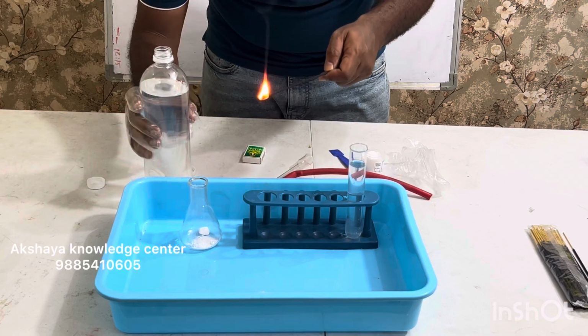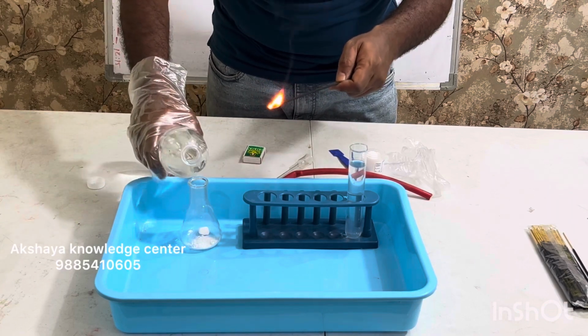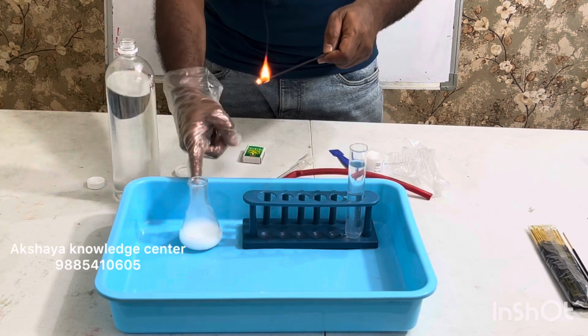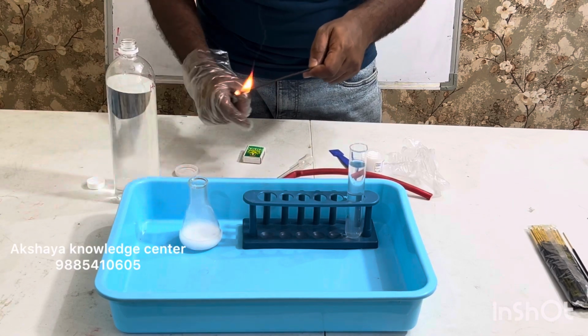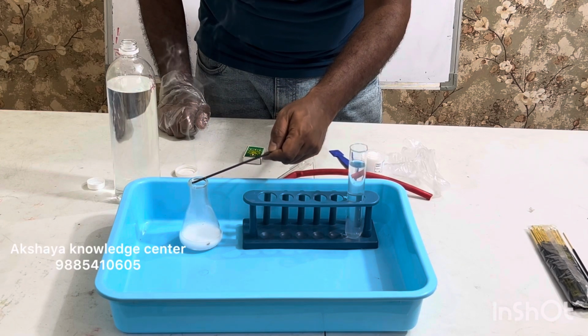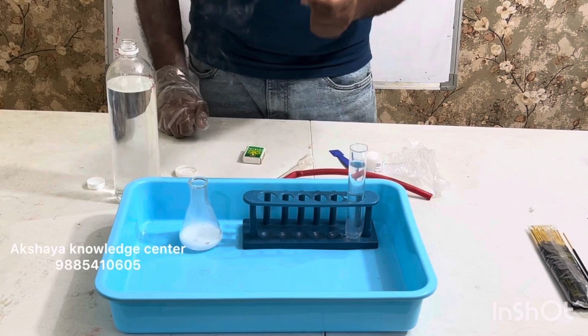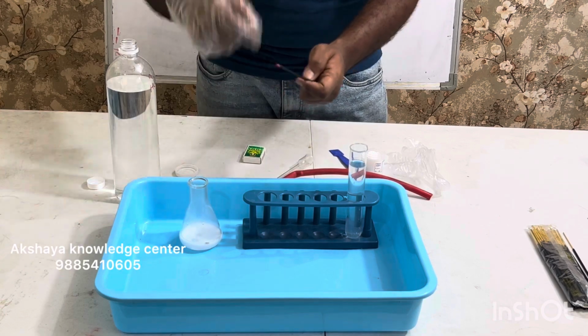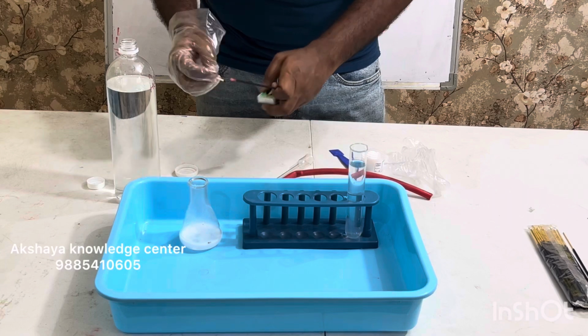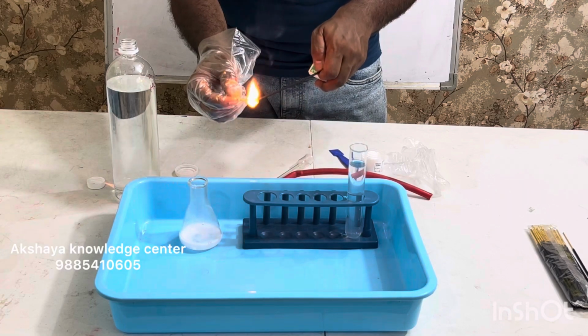Now please observe, I am pouring the hydrochloric acid. Please observe, there's immense fizzing, a lot of fizz. And now I am placing this agarbatti at the top, and as you can see, it got completely put off. You can still see a little bit of red color, but after it got put off, I'm lighting it one more time, please see.